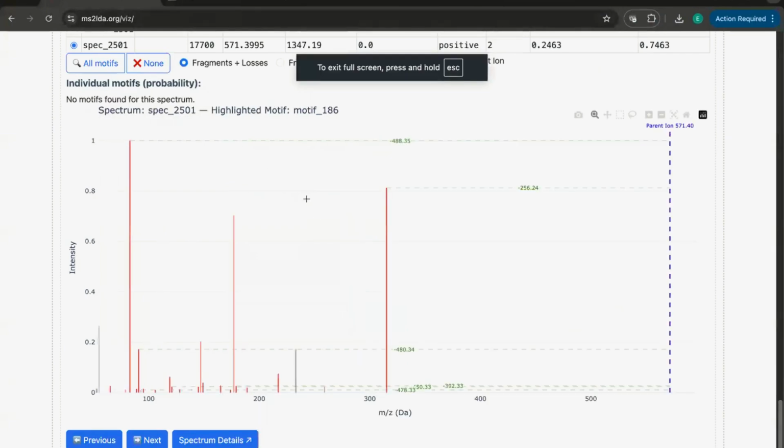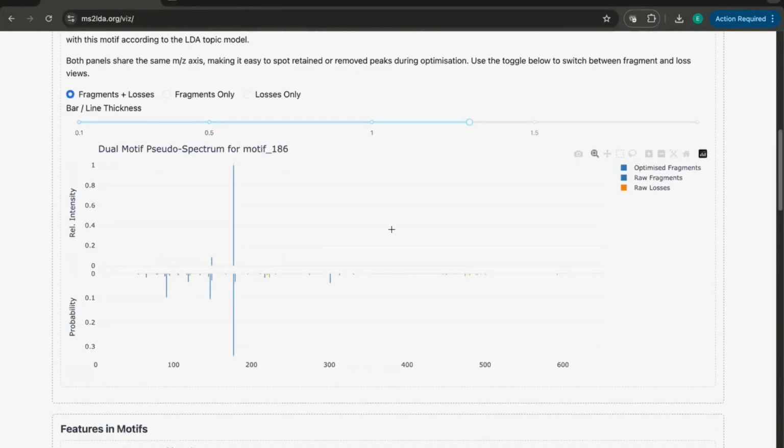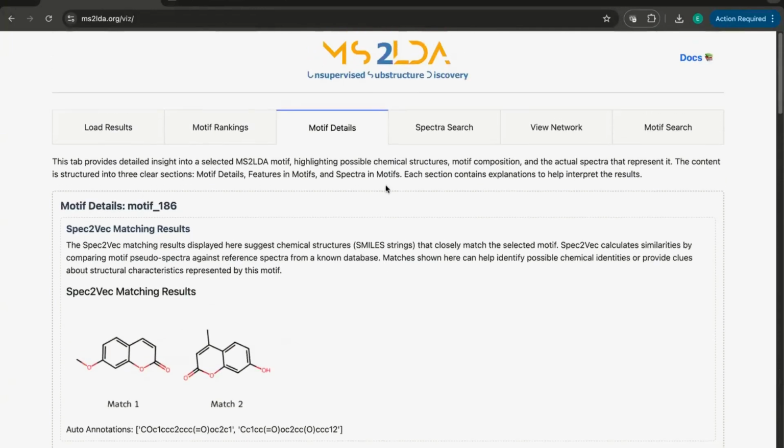So, okay, right now we have seen how these 2 examples deal with different master motifs and come together to explain different substructures of these 2 secondary metabolite families. And basically, we can now go to the different tabs that are still waiting for us.